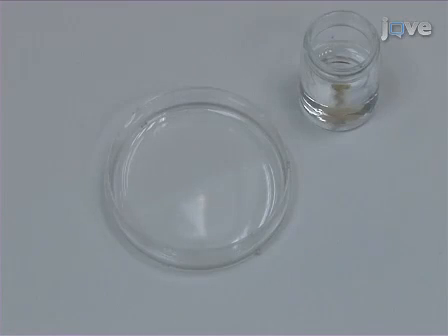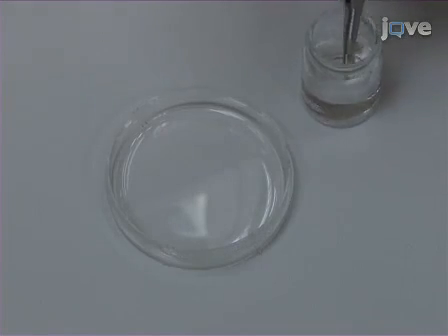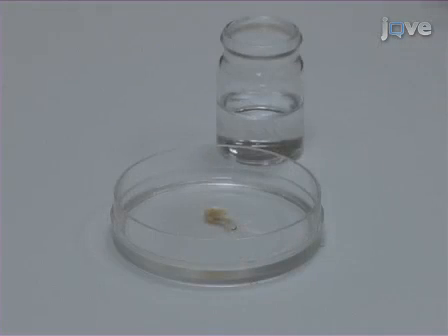Preparation is different for mineralized and non-mineralized tissue. Mineralized tissues must be sealed in containers with a tight fit, so sample position does not change while high-resolution measurements are made. The container shape will vary according to the tissue's morphology. For example, a mouse femur extracted from an 18.5-day-old embryo can fit into a pipette tip.